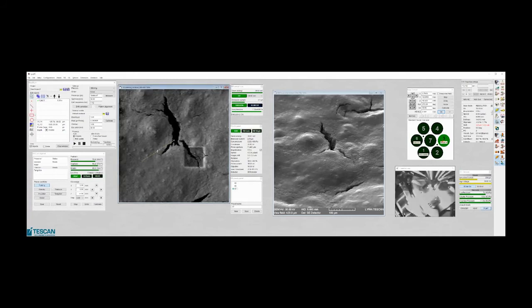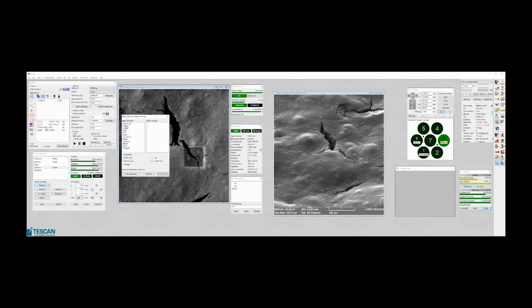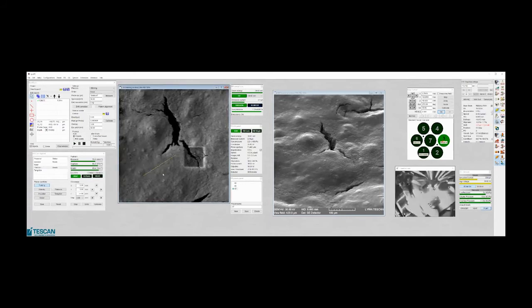So like that. And here is the depth. Here we can choose the material which we are using. We have carbon material, even though we have a very thin layer of platinum cerium oxide. It's not so important for this, but the bottom part is carbon.